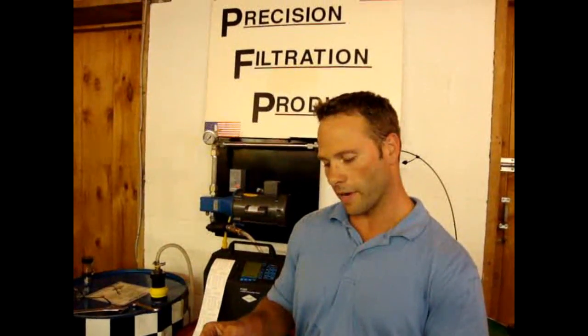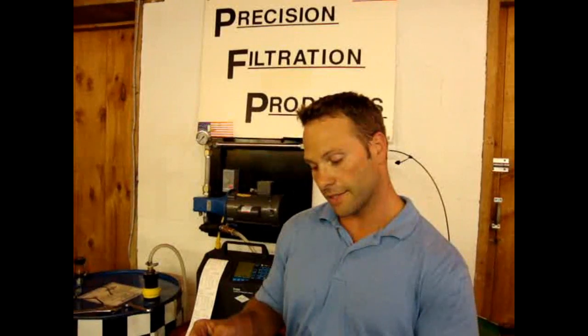What were our initial results? Initial readings in ISO count are 18, 16, 12. That's telling us in the 4-micron channel, we have approximately 2,100 particles per milliliter. In the 6-micron channel, we have about 320 particles per milliliter. And in the 14-micron channel, about 18 to 20 particles per milliliter.